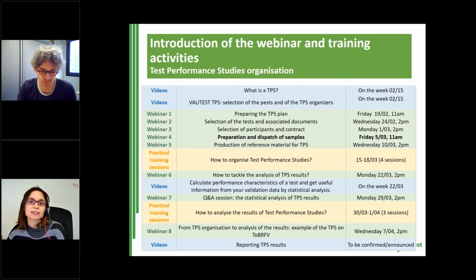Test performance studies are interlaboratory comparisons that aim at evaluating the performance of diagnostic tests. And during this webinar series, partners are presenting the different steps of the TPS workflow through different videos, webinars, and training activities. So we already had several webinars on the preparation of the TPS plan, selection of the test, and selection of the participants. And today's webinar, we will discuss the preparation and dispatch of the samples.